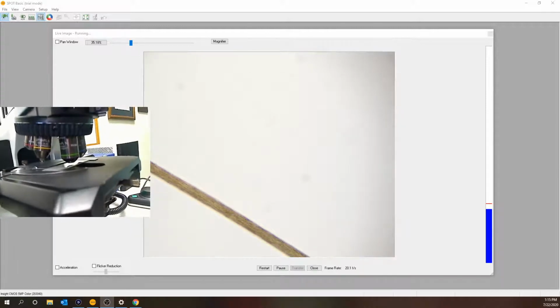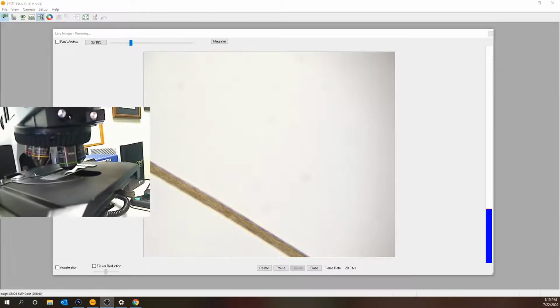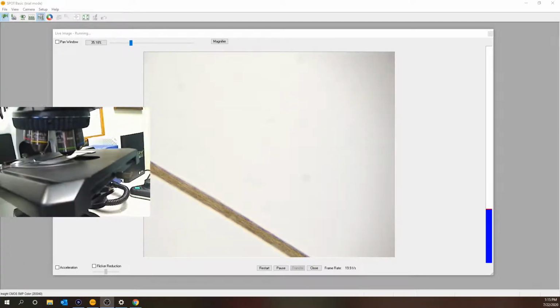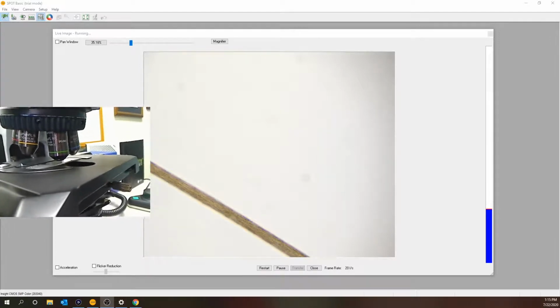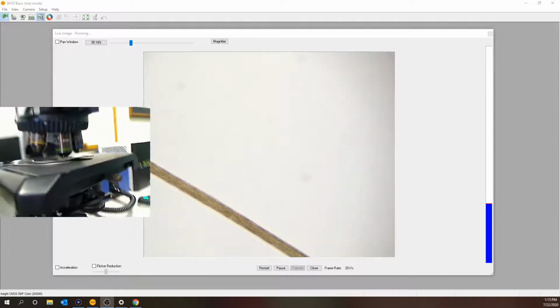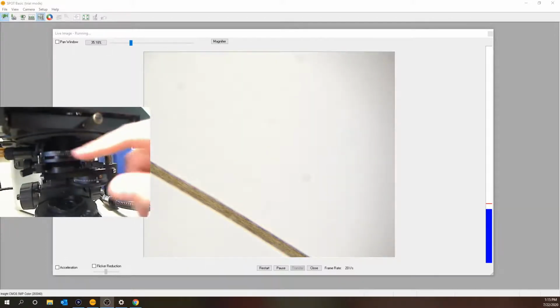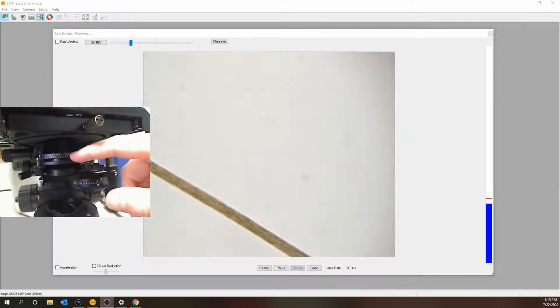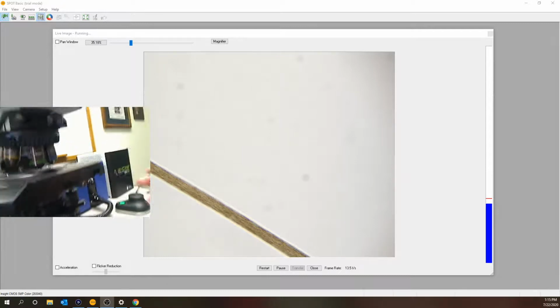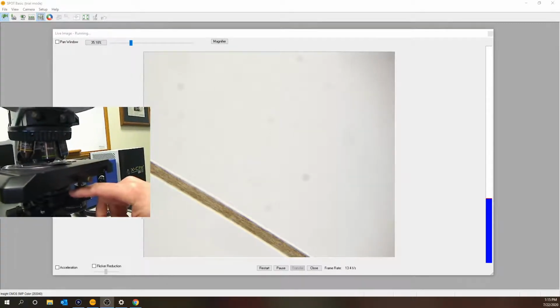In this case, the numerical aperture is 0.30 NA. What numerical aperture really refers to simply is the cone of light that this lens can gather. In an ideal world, to get maximum resolution, you'd come down to your condenser's aperture and set it at 0.3 NA as well. But that's just the optimum resolution. That doesn't necessarily give you that balance between resolution and contrast.